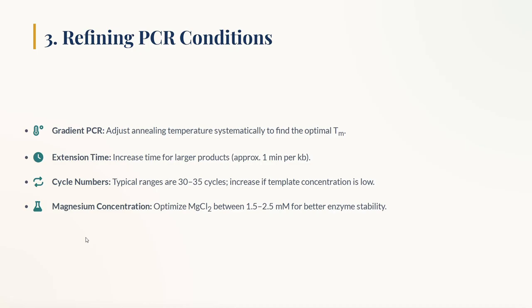So when the template divides again for the 35th time, it won't have any of the PCR reagents, so it won't amplify. And if it is not amplifying, because of extra cycles and a lesser amount of reagents, it will not show you any amplification in the gel, right?